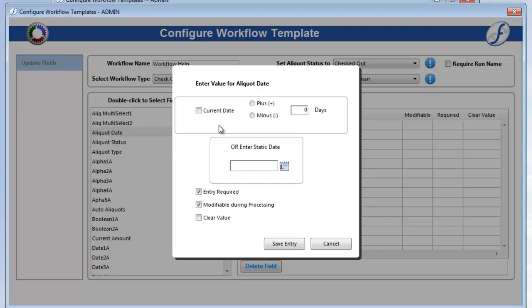For our field aliquot date, let's check Entry Required and Modifiable During Processing, so the user processing must fill in this data.